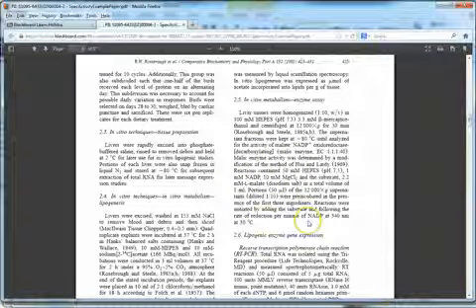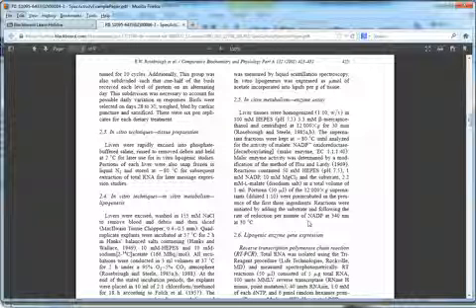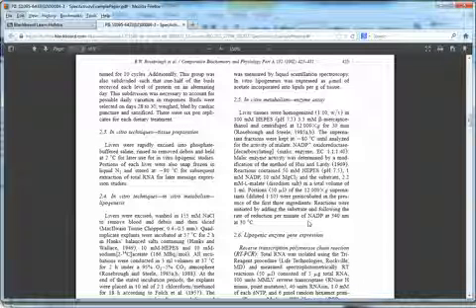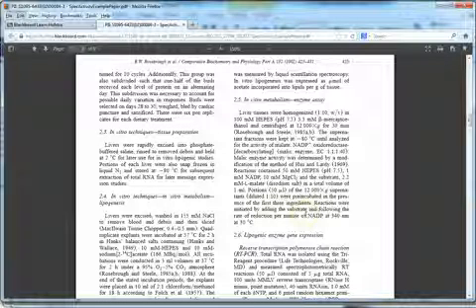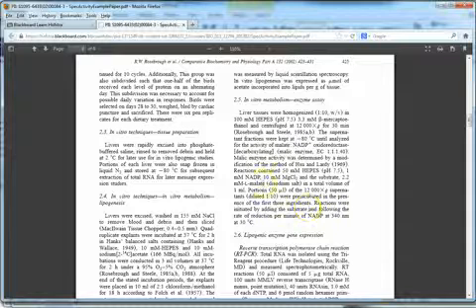The way we did ours is we added everything but the homogenate, and we initiated the reaction by adding the homogenate. They added everything but the substrate, and then they added the substrate and let it go. The reason we didn't do that was because of the whole background thing and the control in reaction 1. We needed to correct for that. We had a reason for doing it the way we did it. So, do you see how brief this is?